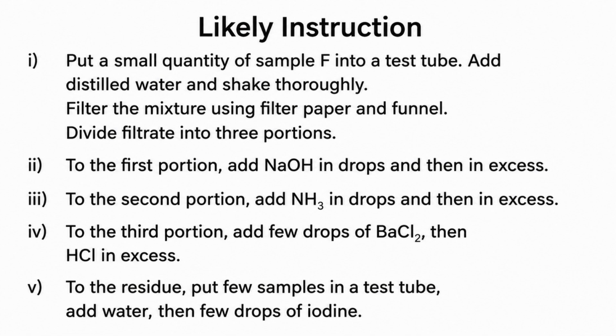This is the likely instruction for the salt analysis. You can pause the video to go through the instruction. Let's carry out the test in this instruction.